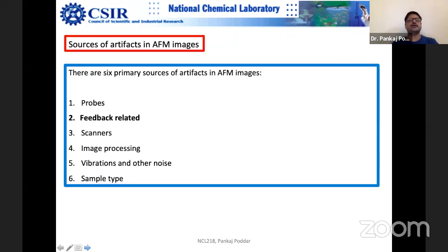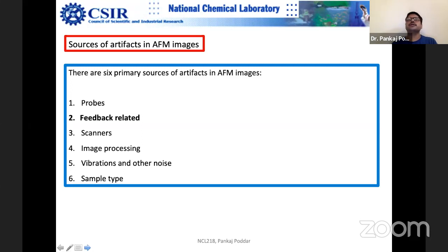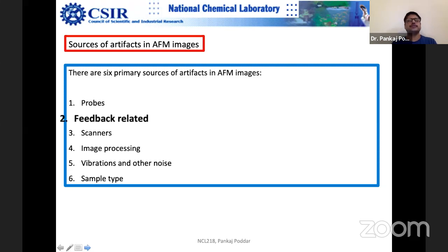Next topic is feedback-related artifacts. When you are chasing the setpoint too closely — PID readings are too tight, gain is too high — you start getting wavy-pattern noise in the images. You have to be careful with this. Feedback-loop-related artifacts are easy to identify. With enough experience, you can identify whether a problem is probe-related or feedback-related.